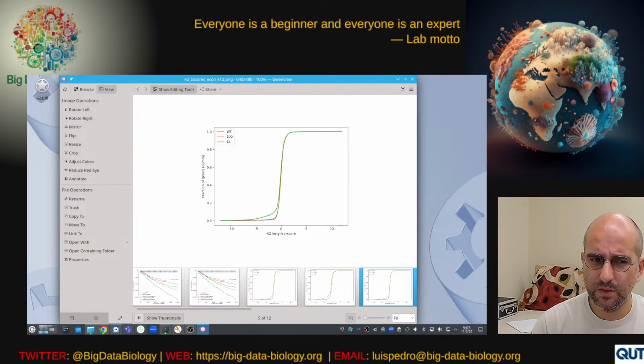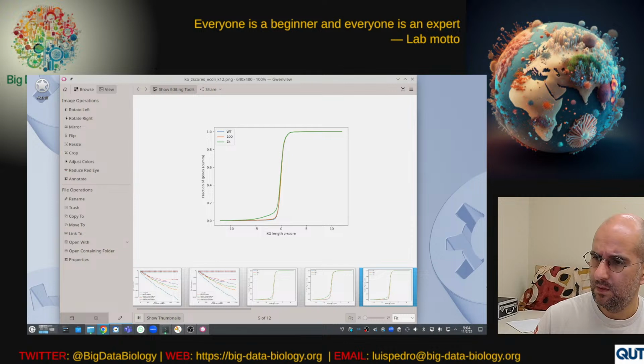We had a few weeks where we went back and forth on what we should use as a reference. So we settled on the GMGC, and so we can get for this. There's some technical thing here, but I think it should be fine. I slightly changed the streaming settings.